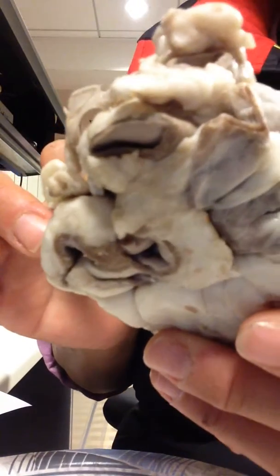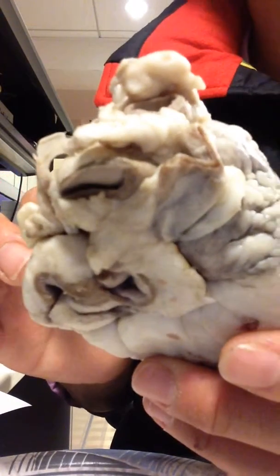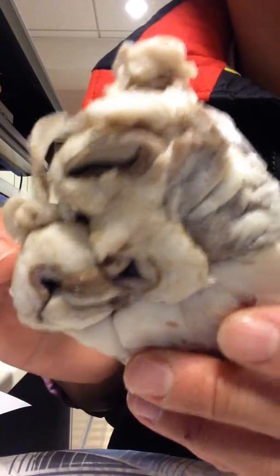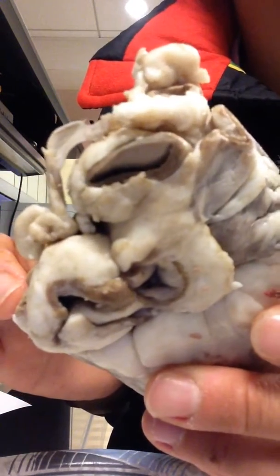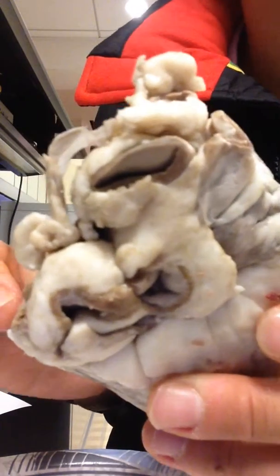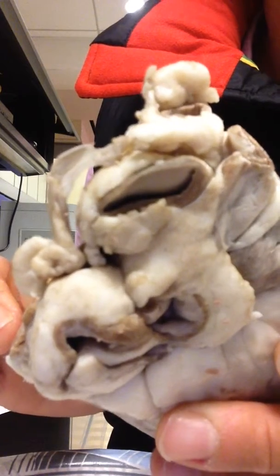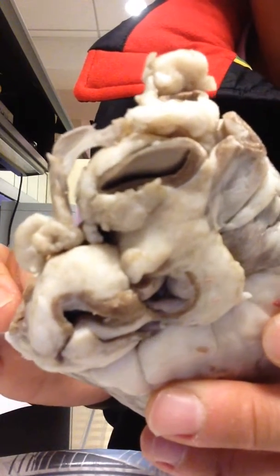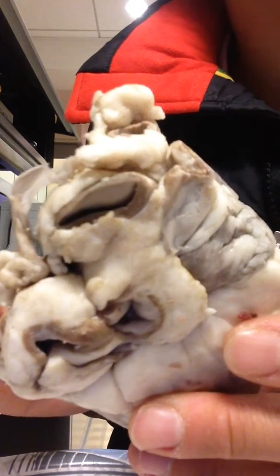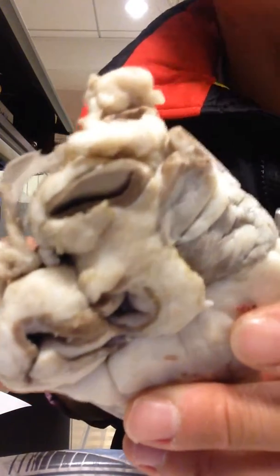And then on that one, what are these used for? So the left auricle collects oxygenated blood as it leaves the lungs and moves it into the left ventricle. And then on the right side, it collects deoxygenated blood from the bloodstream and moves it to the heart's right ventricle.